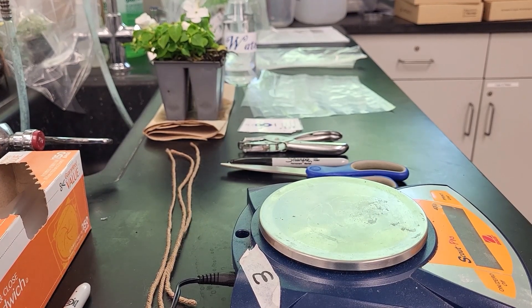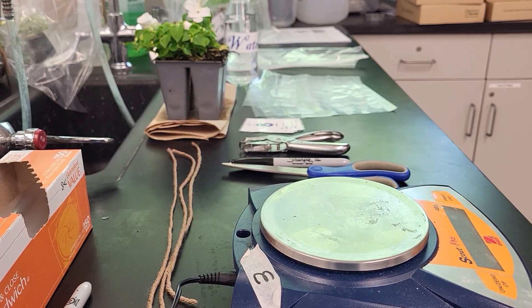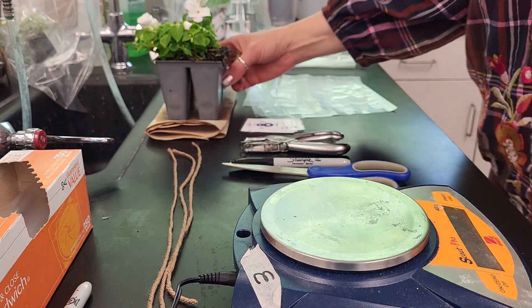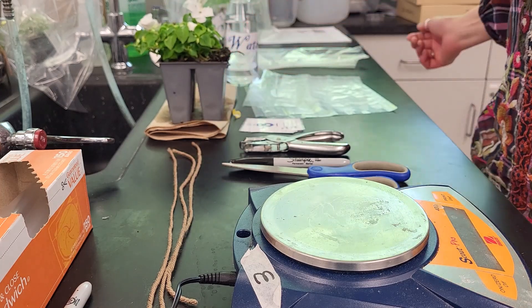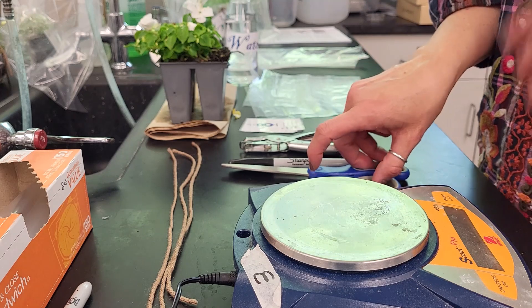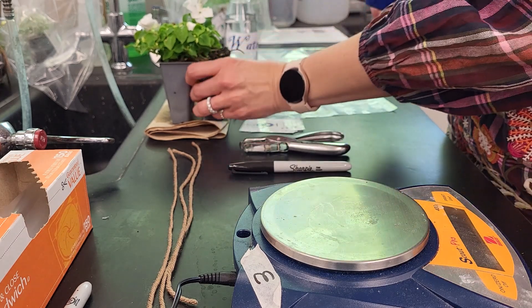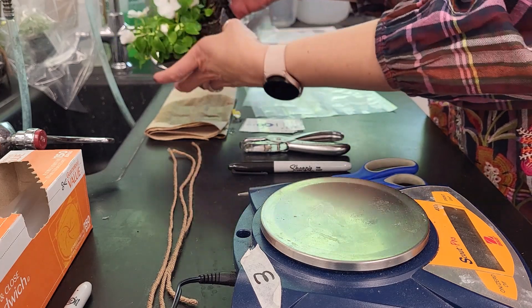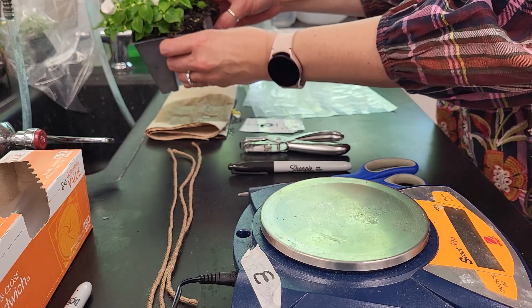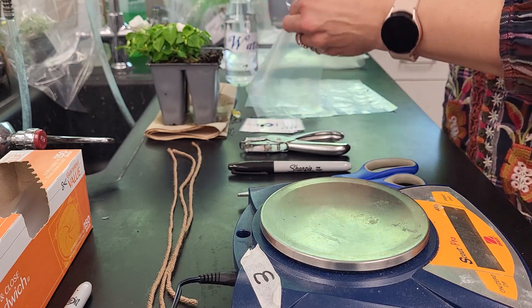In this lab we're going to do the whole plant transpiration lab, where we're looking at the effect of different conditions on the transpiration rate. We've got our plants here — we're going to be using impatiens, but you can use any plant available at your local nursery. We want to take the plants out of the container, take the root ball out. These plants have recently been watered, so there's a good water source in there.